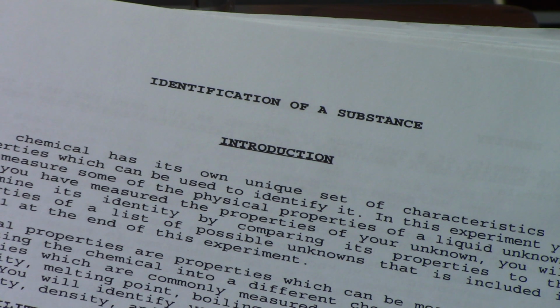The second test I'm going to do is measuring the density of my unknown. And density is mass divided by volume. So what I'm going to do is measure the mass of a substance and its volume and determine its density by dividing the mass by the volume.